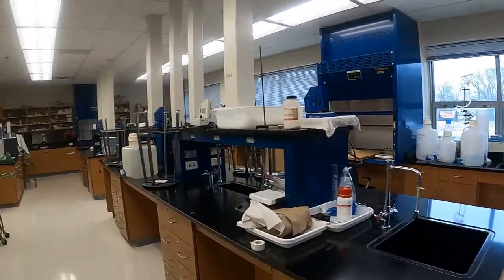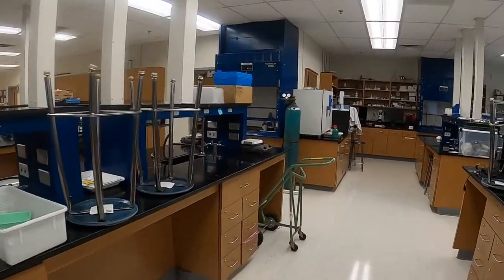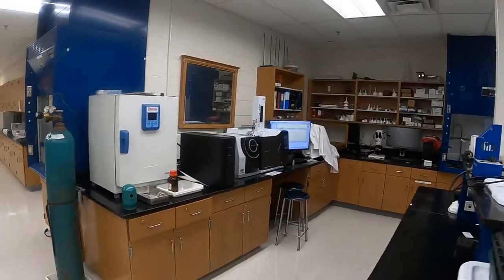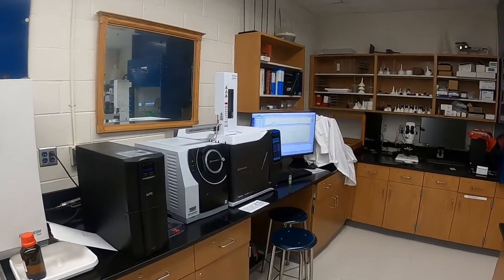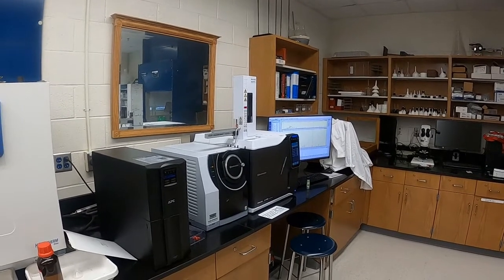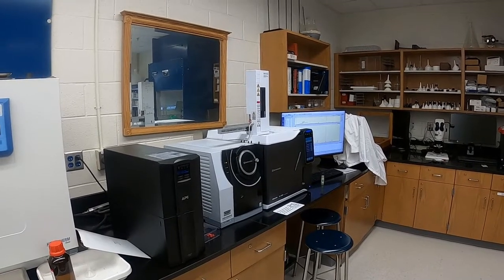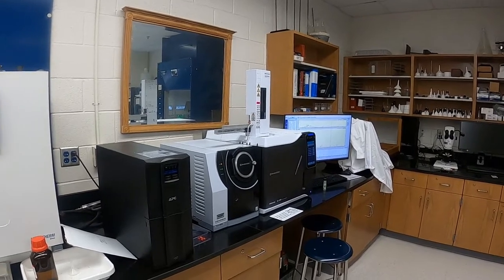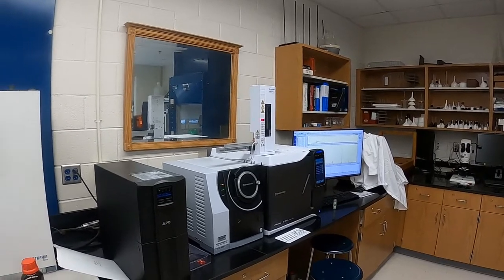So the lab is very well spread out and spacious, lots of room for project setup, equipment setup, student projects, lab work. Over here, we have what's called a gas chromatograph mass spectrometer. It's a two-part instrument, gas chromatograph and mass spectrometer, or GCMS for short. The gas chromatograph provides a way to separate out mixtures of compounds in a sample. And then the mass spectrometer on the left-hand side is the detector to determine what compounds are actually present.